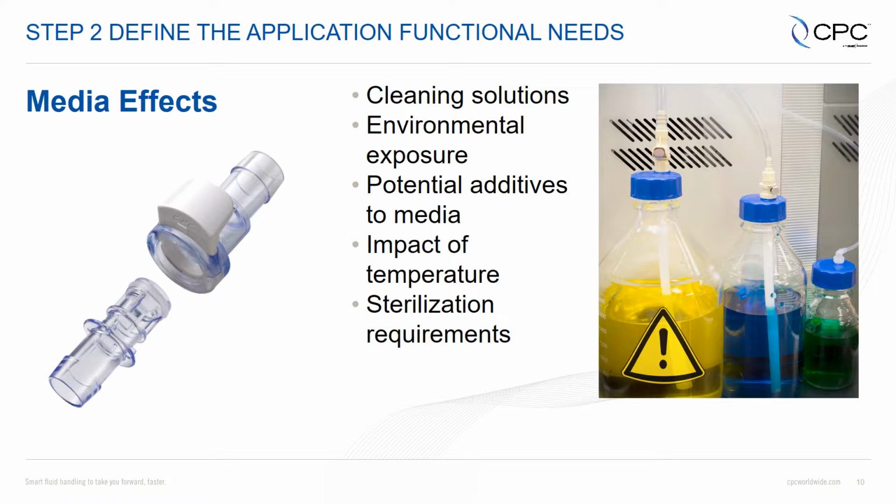And certainly whenever you're looking at chemical compatibility, you want to look at the impact of temperature, because sometimes that can accelerate issues relative to chemical breakdown or degradation with a plastic. In addition to how it may be cleaned or how the product may hold up to the media, the fluids, you also want to look at sterilization. Sometimes people will sterilize or sanitize with different chemicals, or it might be irradiated, say for example with gamma or E-beam sterilization.